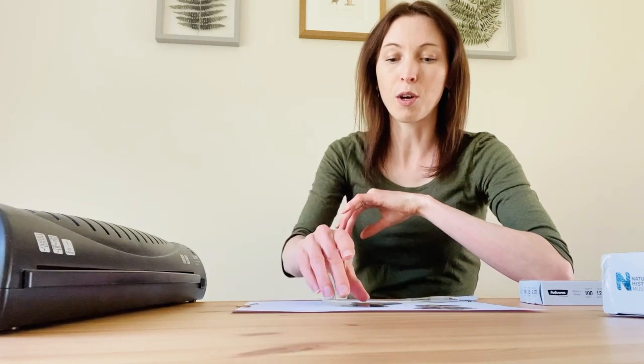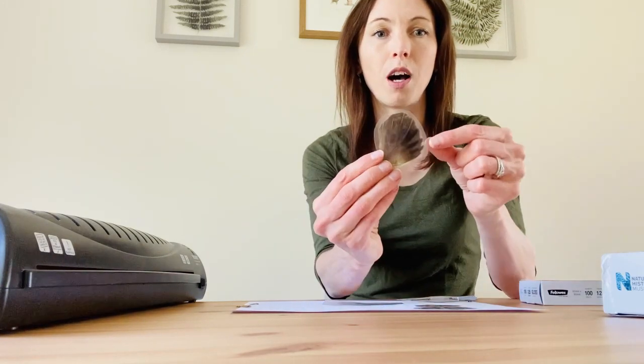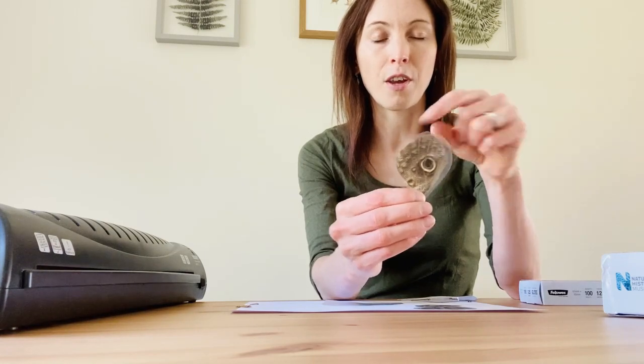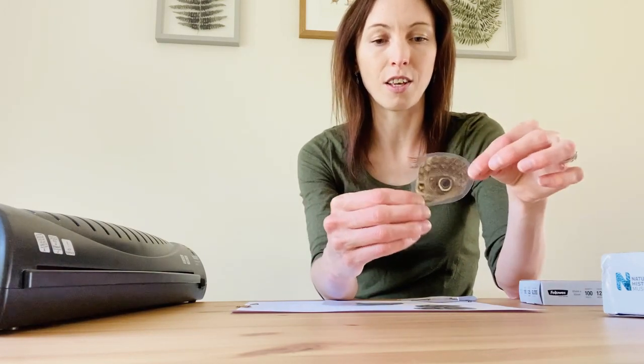Hello, it's Gemma here and today's video is going to be about how to make your own ethical microscope slides — and they're really simple and easy to do. The reason I'm describing them as ethical is because I am using animal parts, but I am using animals that have had a natural death, so nothing has been killed to make the slides you're going to see today.